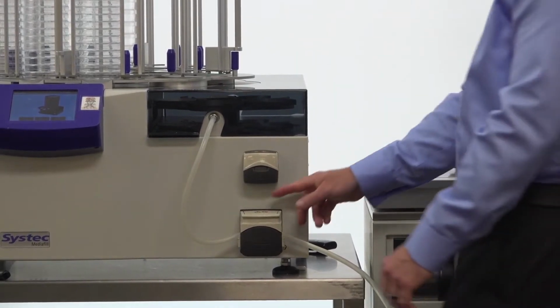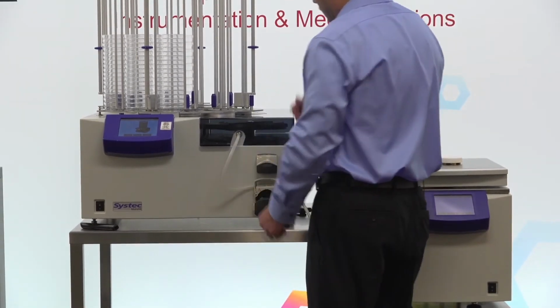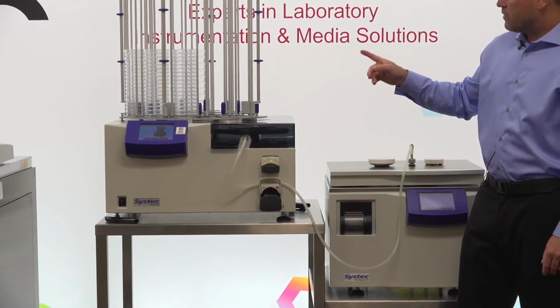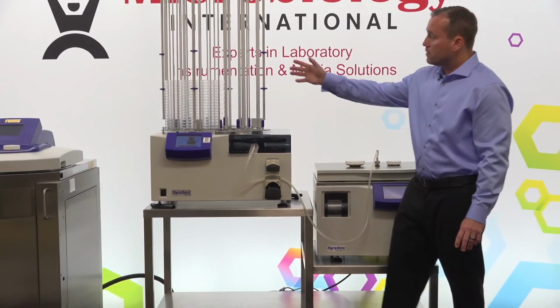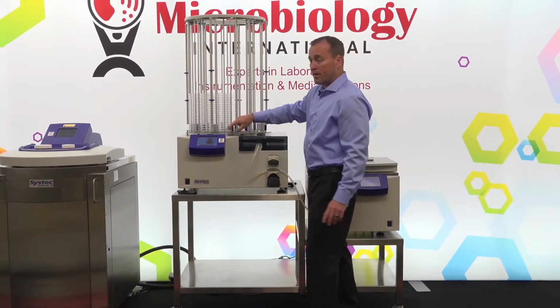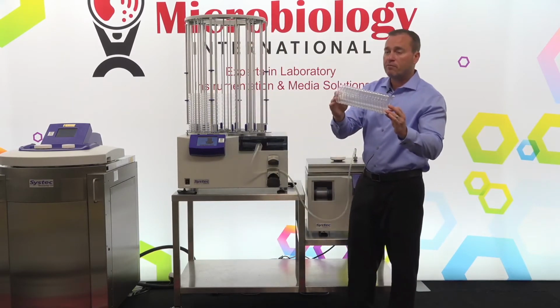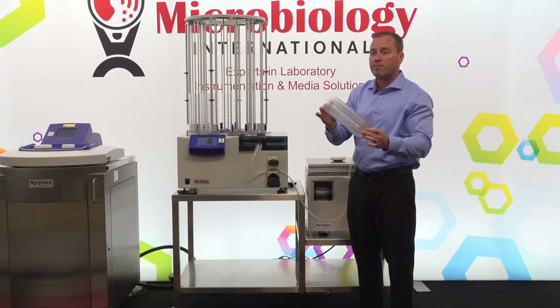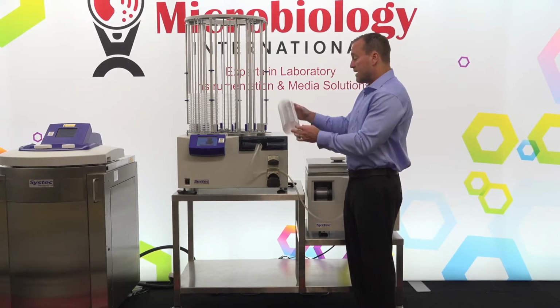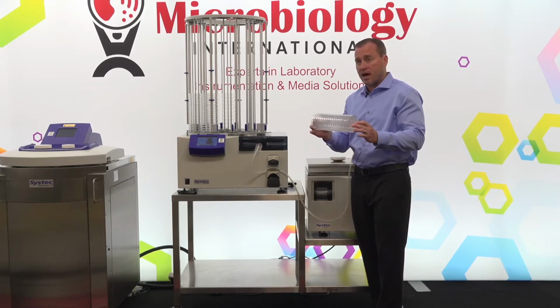Okay? So we will start. I'm going to move that tubing out of there so it doesn't get damaged. And then we would start the MediaFill. The MediaFill has a carousel that is easily loaded, so the plates just simply go into the system. We can just remove them. Any type of plates we can use, because we do have a plate catalog inside of the system that allows us to program individual plate types into it.